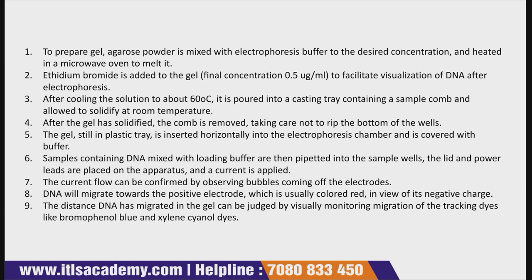Then you heat it in a microwave oven to melt it. After that, ethidium bromide is added to the gel.